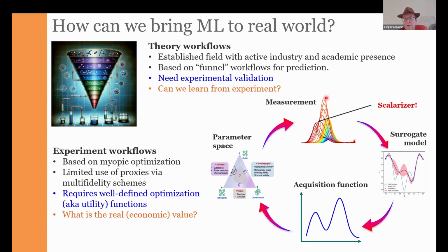So for example, if we take a photoluminescent measurement, we pick the height of the peak, so the quantum efficiency, width of the peak, or the position of the peak, given the bandgap. Obviously, as you can imagine, for X-ray, this can be much more complicated, because sometimes in the X-ray spectrum we care about the properties of the primary phase. Sometimes we care about the disorder, so for example, the width of the peak, and sometimes we care about the presence of the secondary phases that are known to be detrimental to our application.